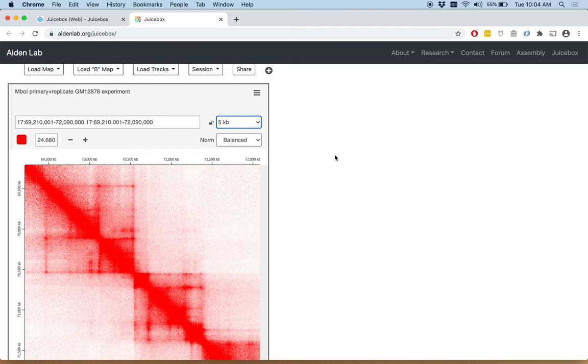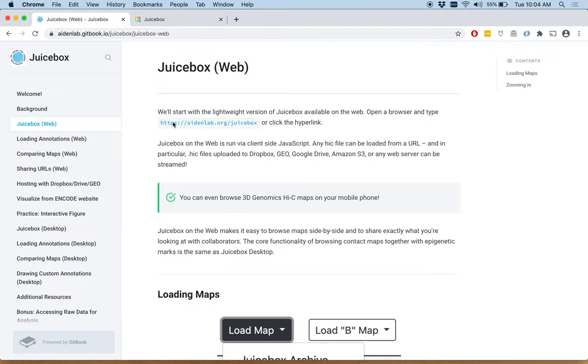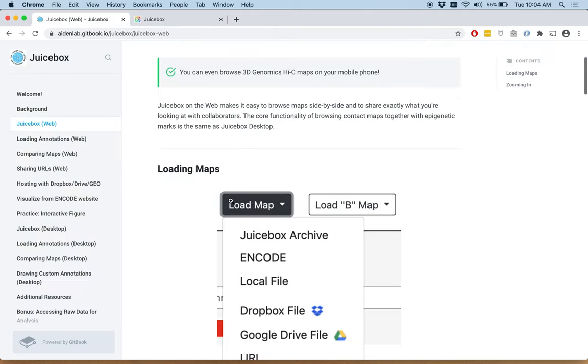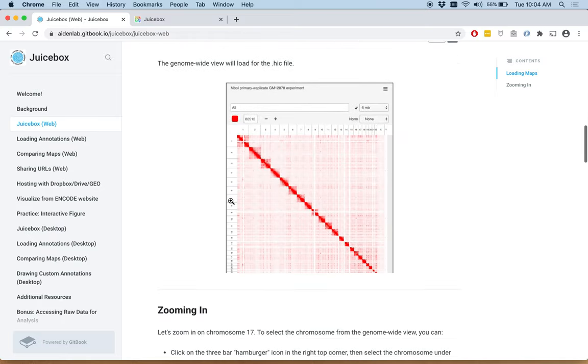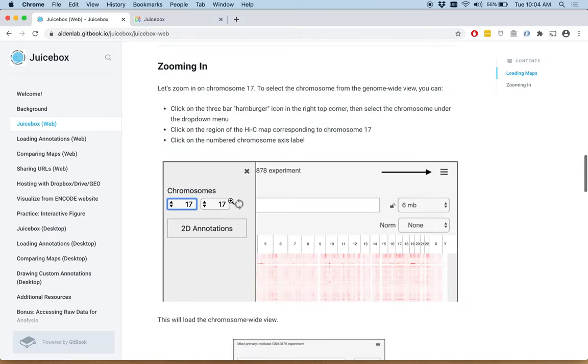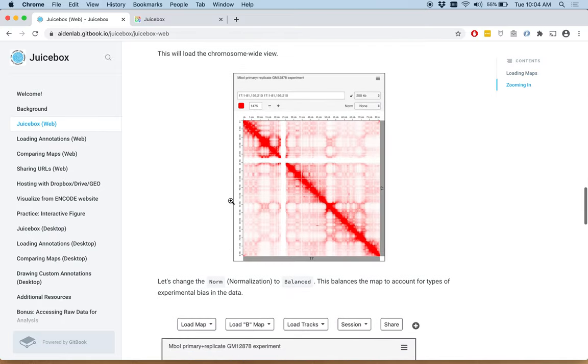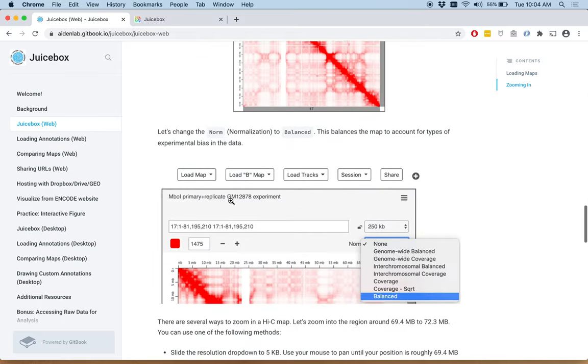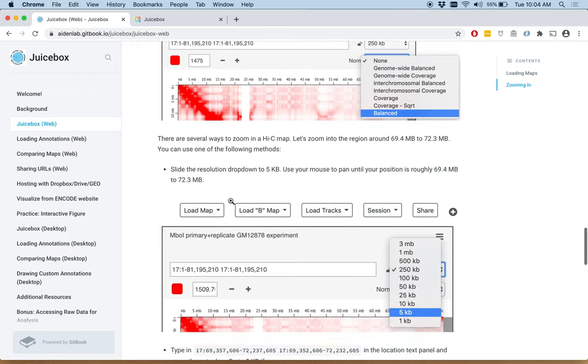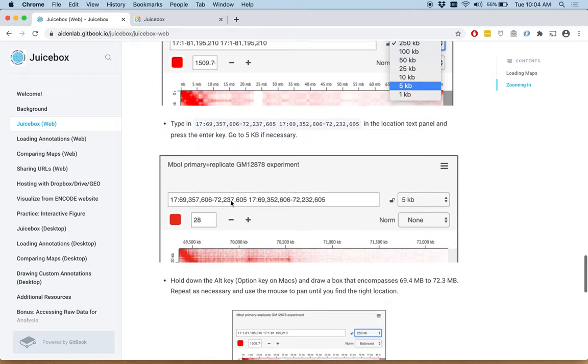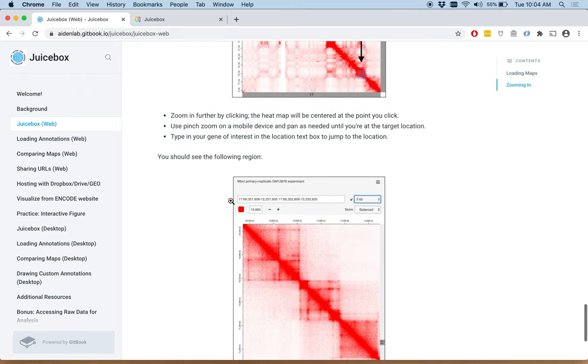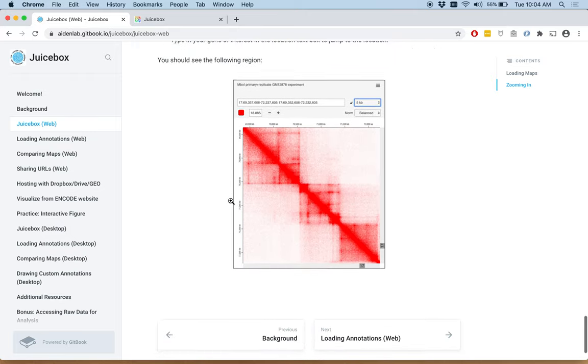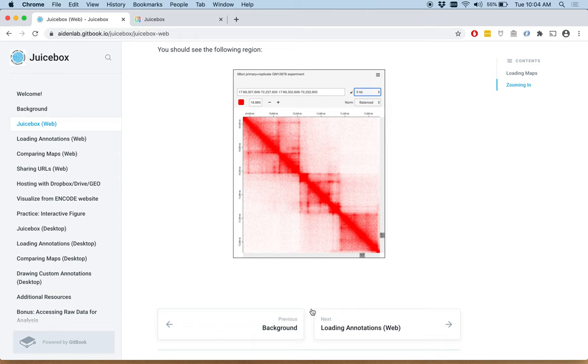Once you've zoomed into the region, you should see a picture that looks like this. When you're on the tutorial, we've helpfully shown you images of what this should look like. And so once you've zoomed in, you arrive at this image.